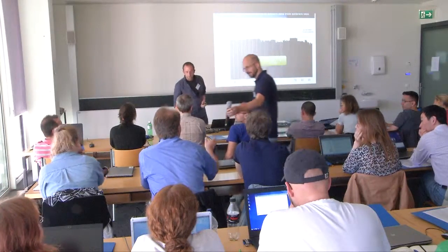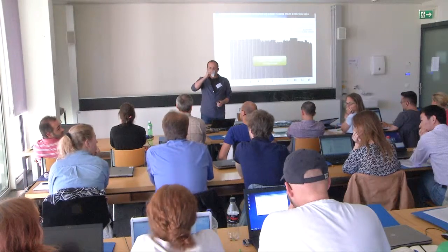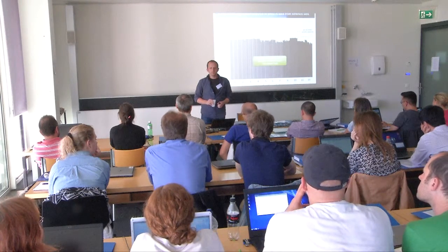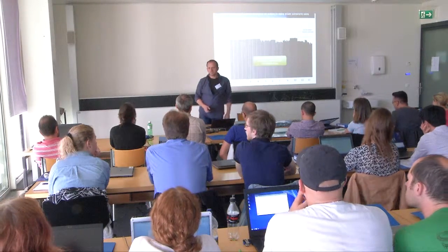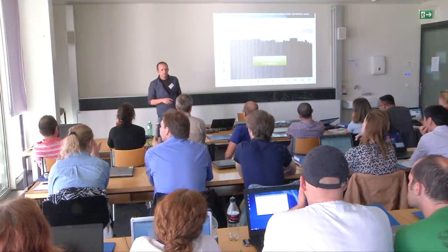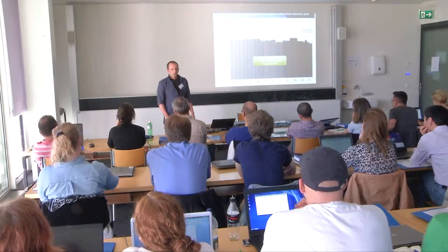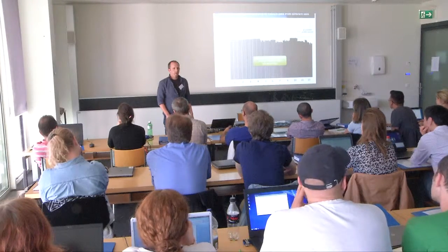I just try to formalize the question. How difficult is it, from your experience, to use spectral libraries from repositories? They are created in a specific matrix and you want to measure in another matrix. Right. So this is covered a little bit in tomorrow's talk. I guess I will make a short answer now. We haven't looked that much into the matrix effects, I have to say.